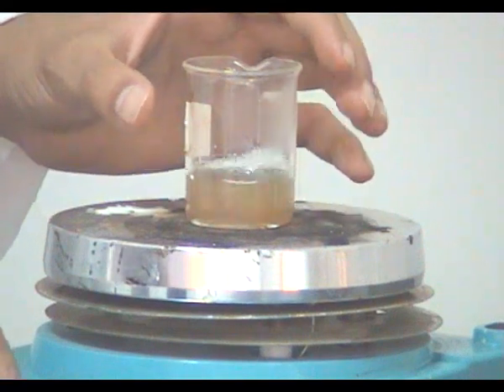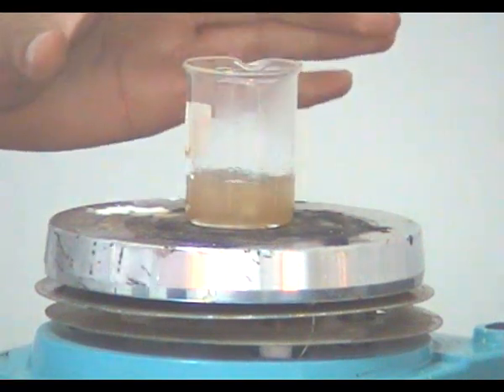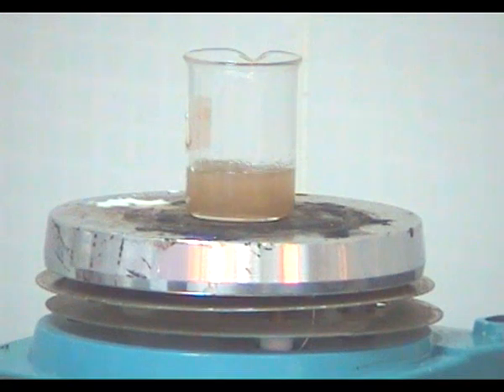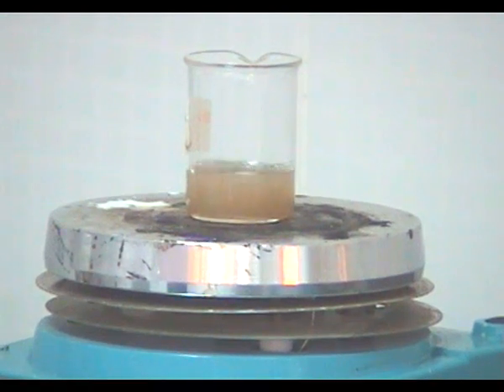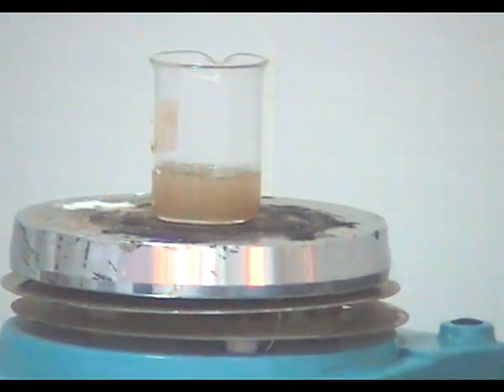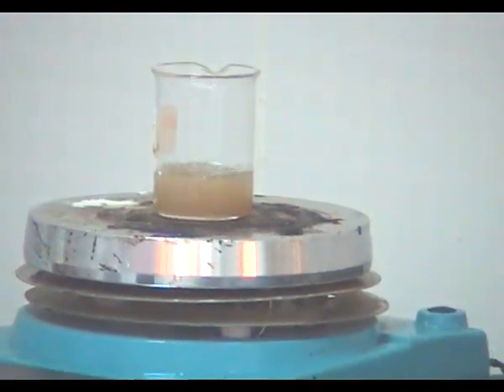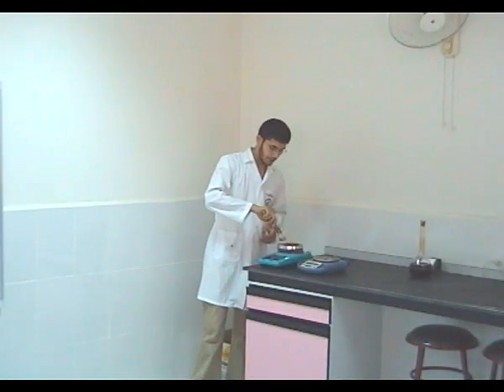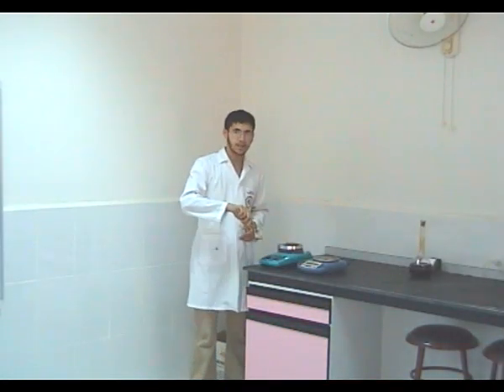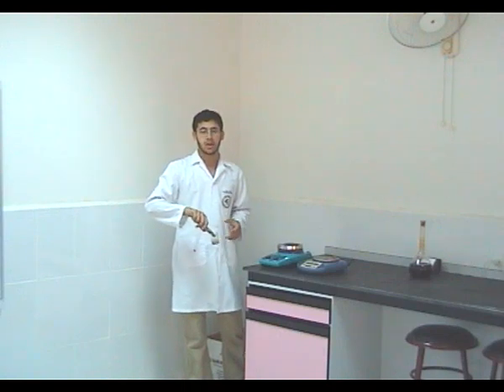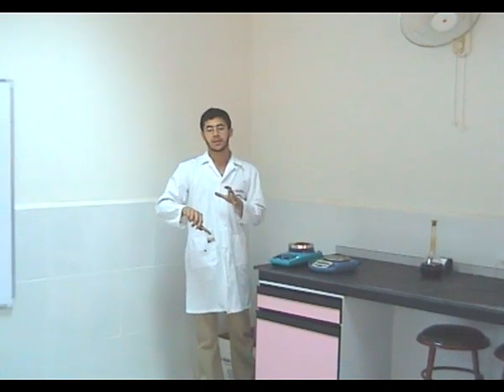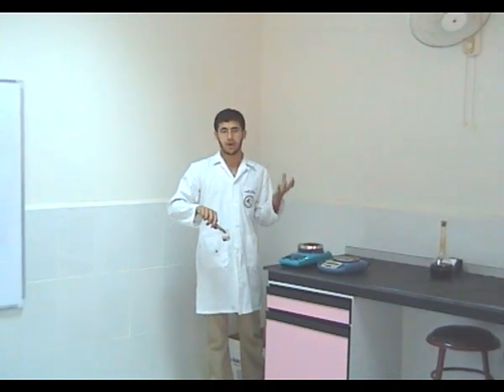The temperature should reach a gentle boil — not a very strong boiling. After the additional ten minutes, after the solid mass has dissolved, we will cool it down until crystals of paracetamol are formed.